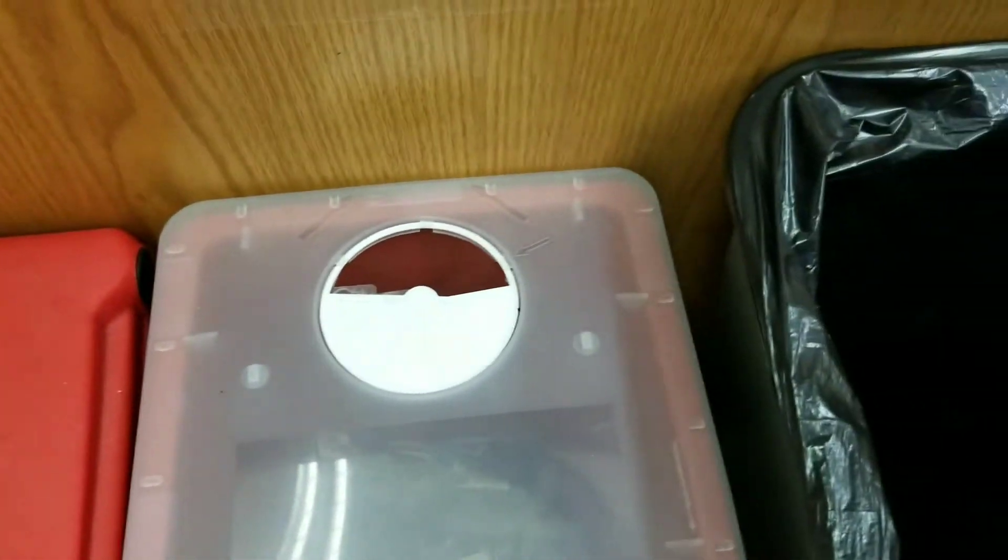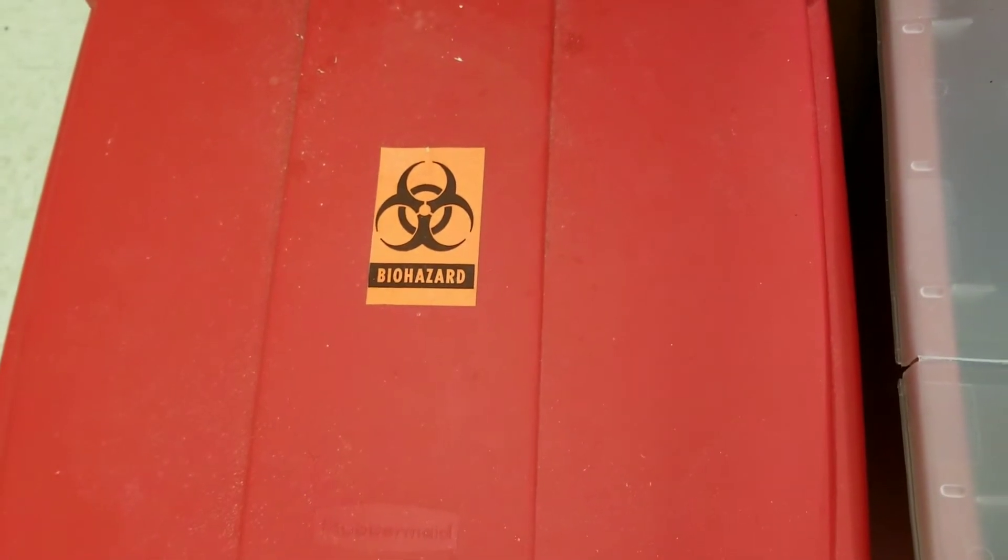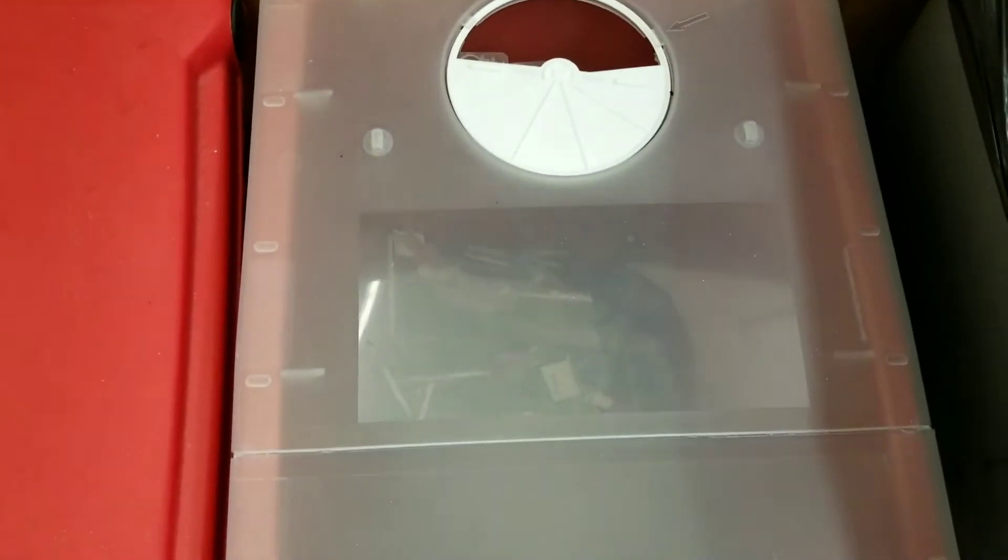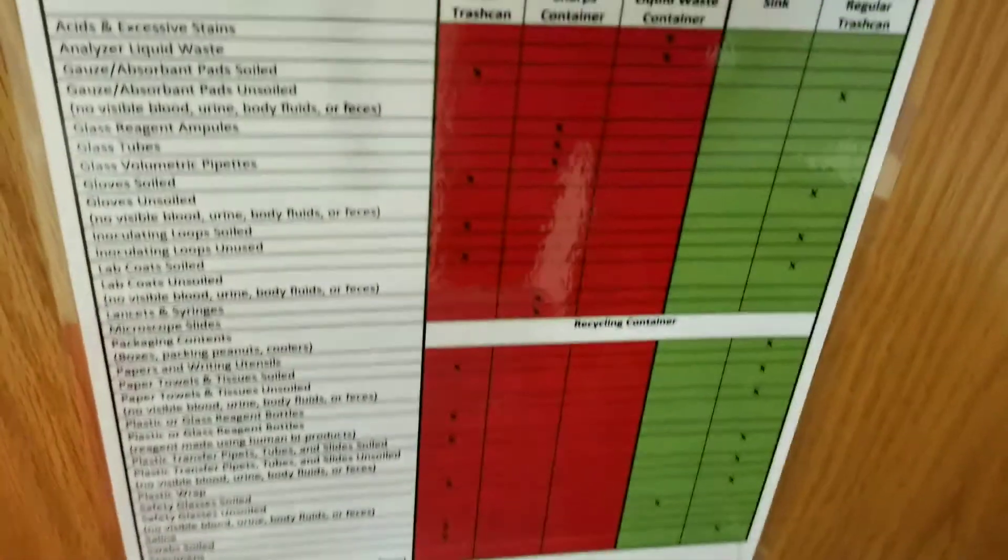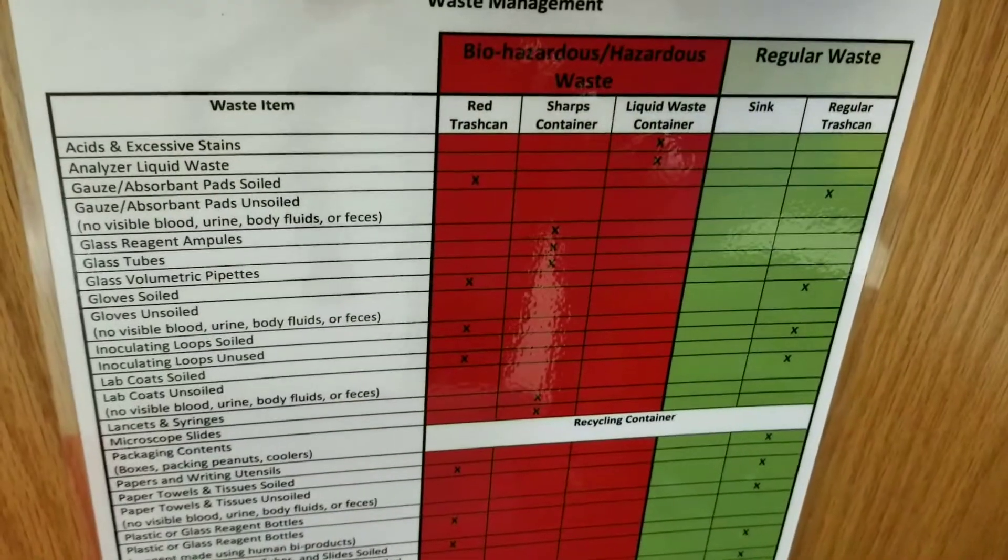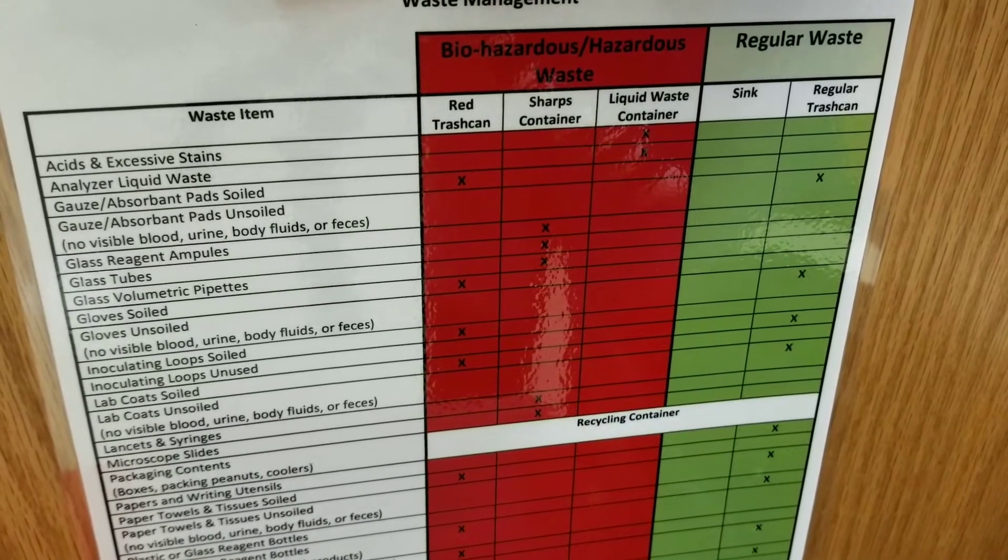This is all solid waste. So this is the solid biohazardous waste. This is the sharps container and this is the regular trash can, and all of these are demarcated on this chart right here.